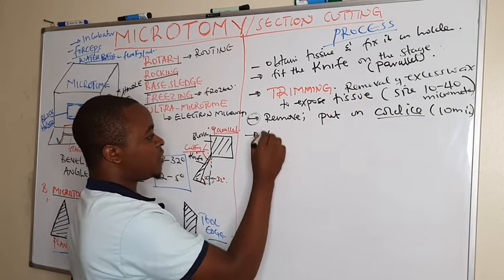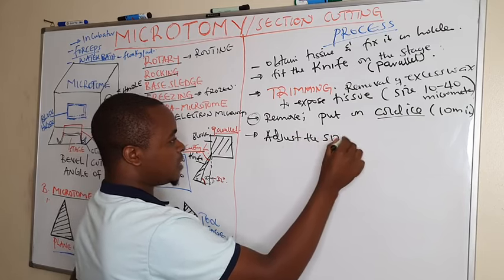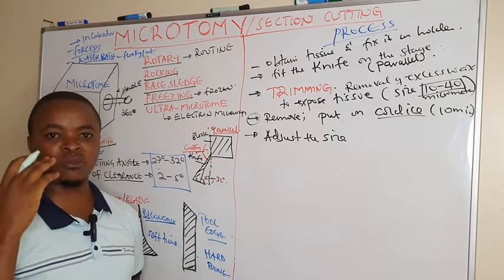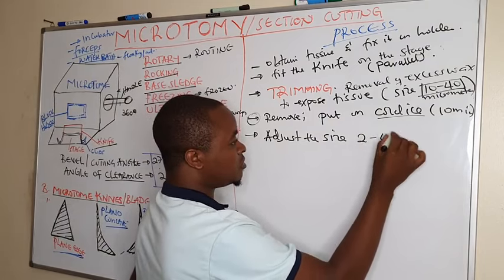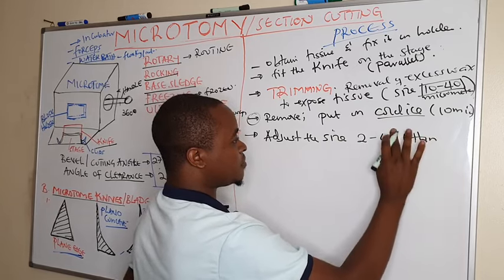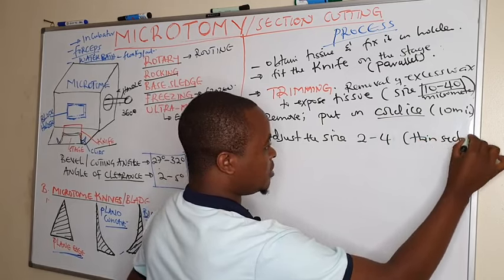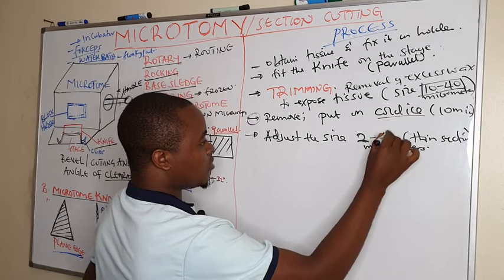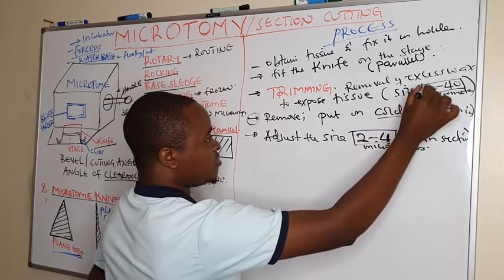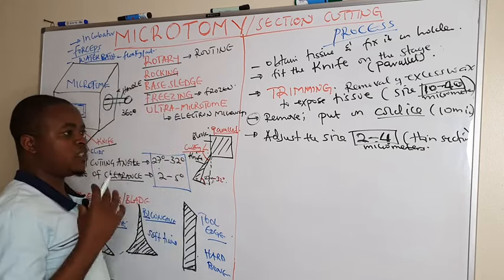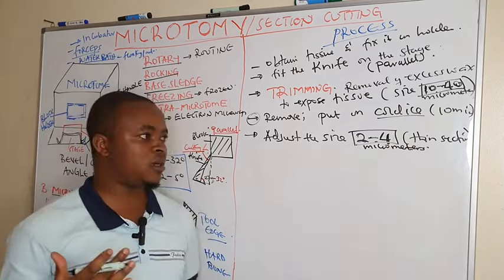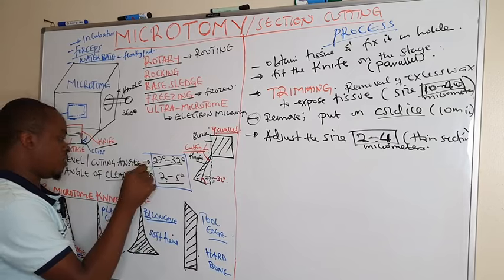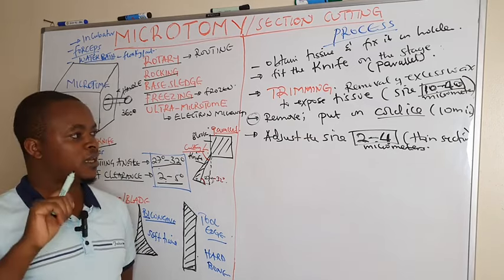After cooling it on the cold ice, bring it back and fit it on the block holder. Now we are ready for section cutting — adjust the cutting size from the trimming size down to 2 to 4 micrometers to enable cutting of thin sections. Make sure the knife is parallel with the block, the angle of clearance and bevel angle are set, and the knife is tightly clipped on the stage.